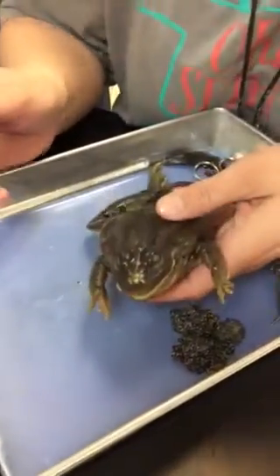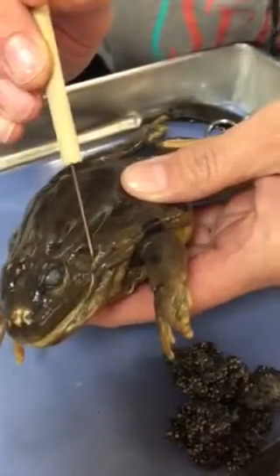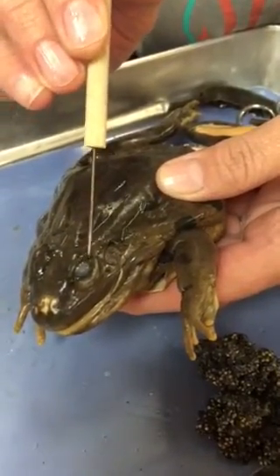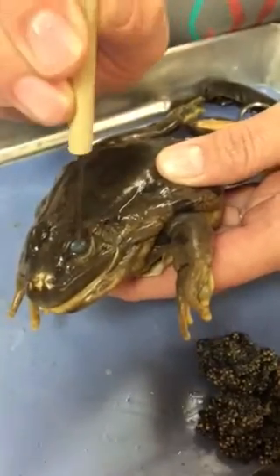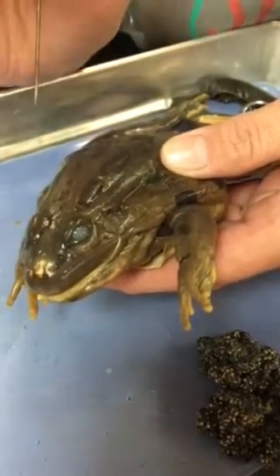So, looking at the external features, right here we have the tympanum, which is the eardrum. You have the nictitating membrane. So, eye is not one of your choices. If I have a pin just inside the eye, then I'm asking for the nictitating membrane.